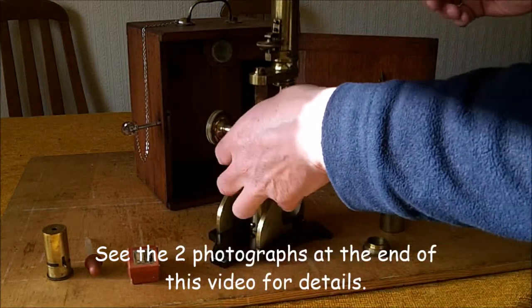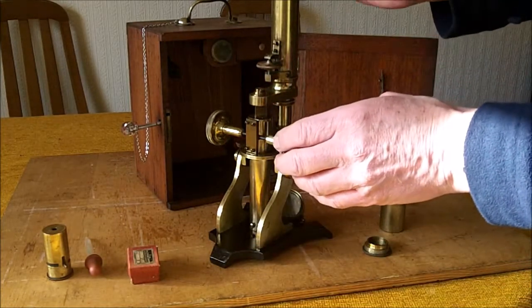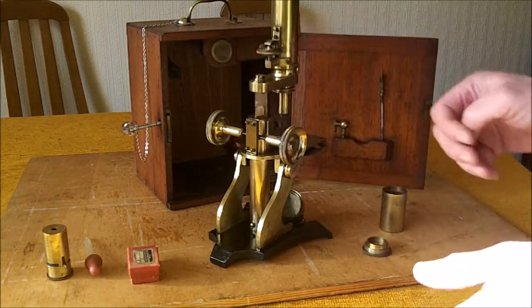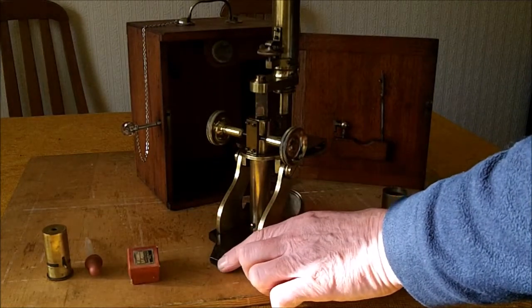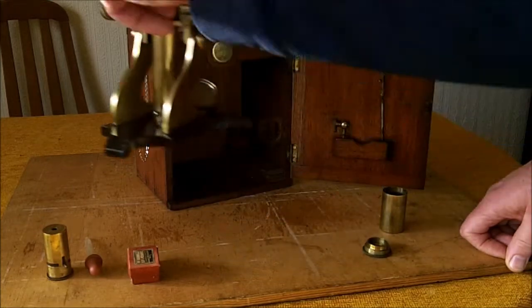In addition to completely polishing the brass components, and ridding the cast base of rust and repainting it.